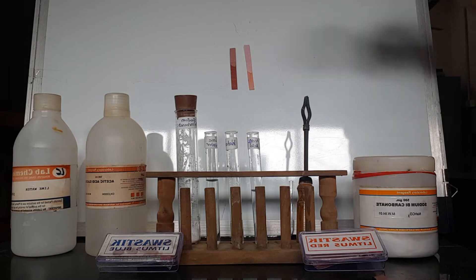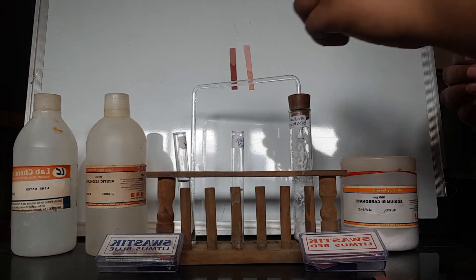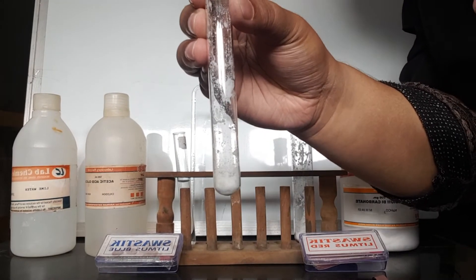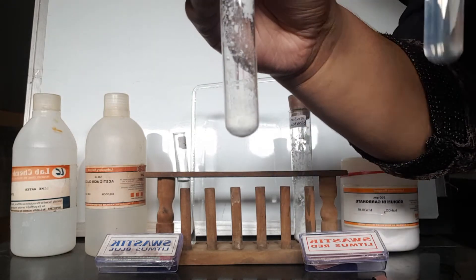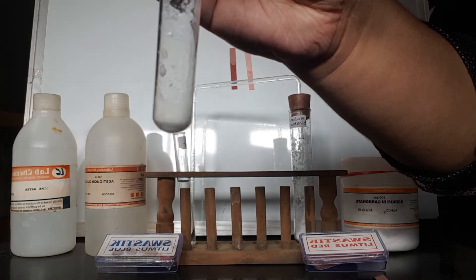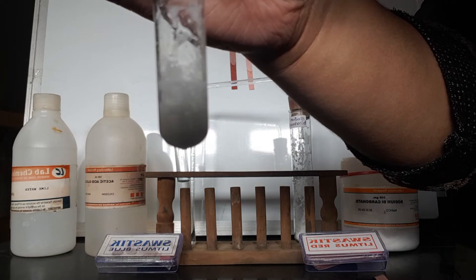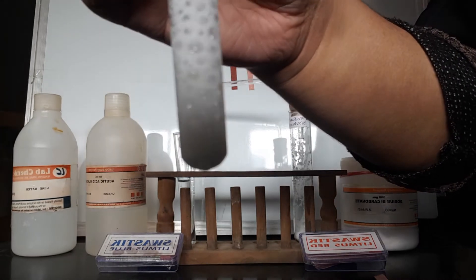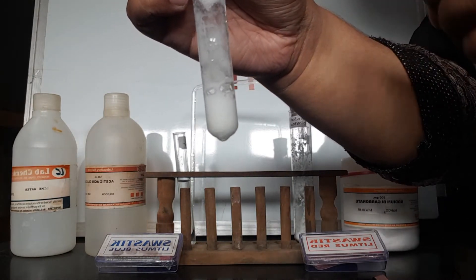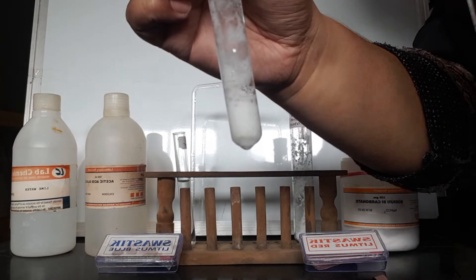The next test we have to do is with lime water and sodium bicarbonate. We take a pinch of sodium bicarbonate and add acetic acid to it. You can see there are brisk effervescences coming out, which shows that a certain gas is being released. We need to test which gas it is.